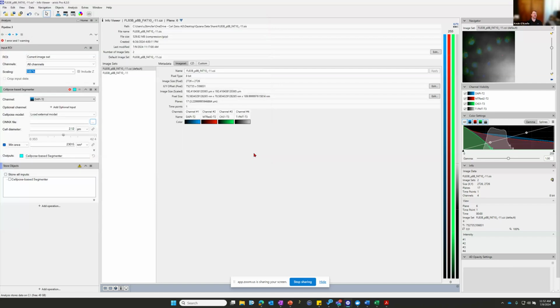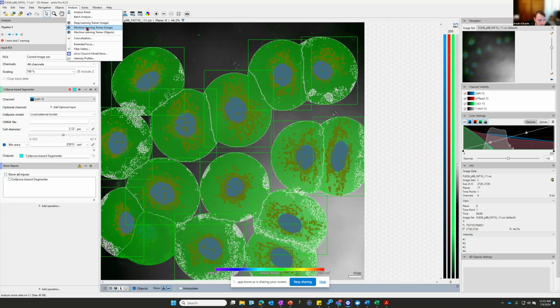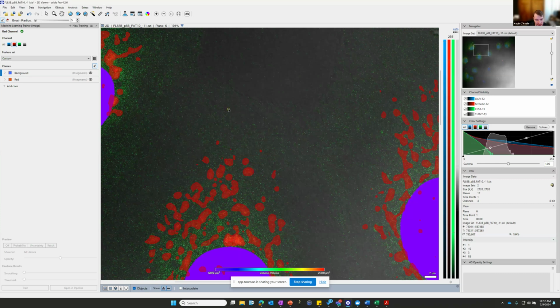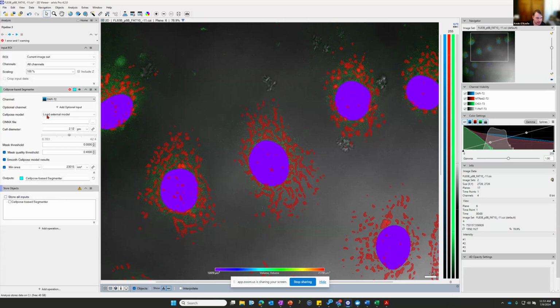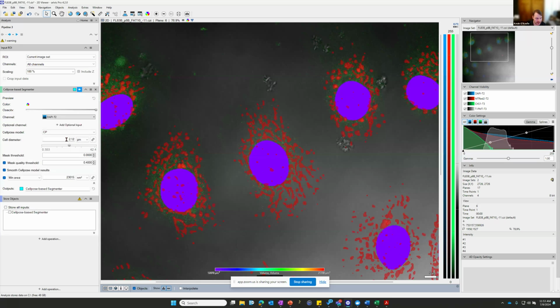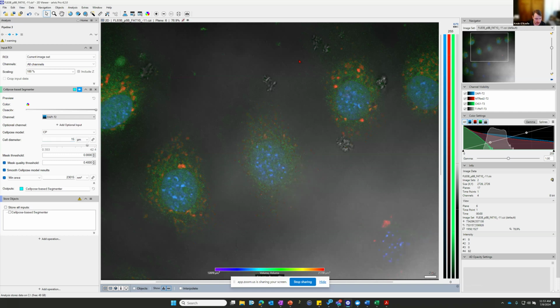I do not. But it's the same exact thing you would be doing for this deep learning trainer, where you're going through and actually annotating your objects. If you wanted to create your own custom Cellpose model, you would go into Anaconda, which is an IDE for Python. If you want to get it set up, we can work with you and get it set up on your computer, so you don't have to worry about setting that all up. You would go into Anaconda, type in cellpose or whatever the function is you'd have to call, and then you would have a GUI that would pop up. You would load your image. You would then run in that GUI one of these pre-built models. So this set of 2, for example.